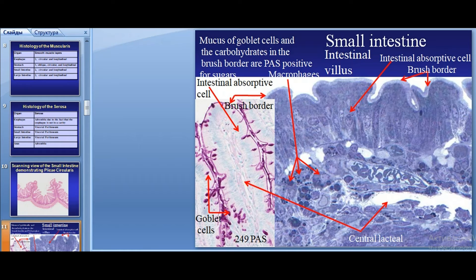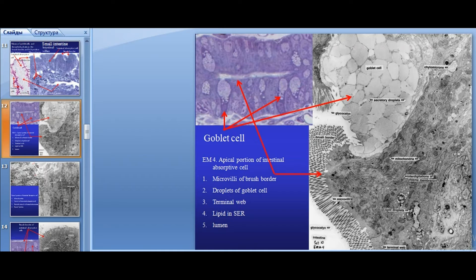Goblet cells look like gaps in the epithelium body, interspersed between enterocytes. In the apical part you can see secretory granules. They produce mucus secreted through the apical surface for lubrication and protection of the epithelial surface. The organelles and nucleus are pushed to the basal part of the cell by the accumulation of secretory granules.